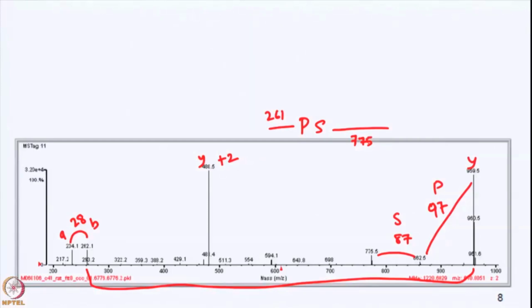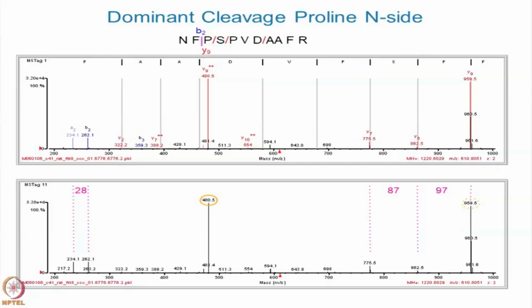This one comes from a tryptic peptide experiment, and so there should be either an arginine or a lysine here. Okay, that's about all the information there is in that spectrum. Okay, there's the PS part. That's about all the information there was. That information all together is enough to produce that one answer as a peptide from the human proteome.